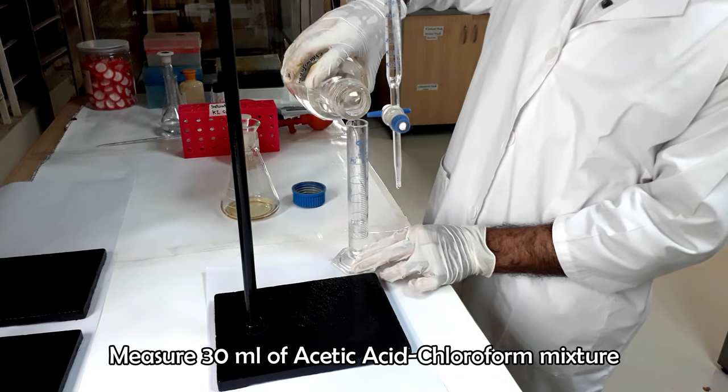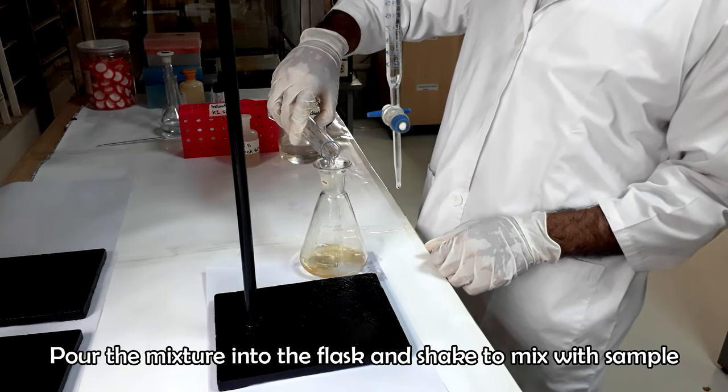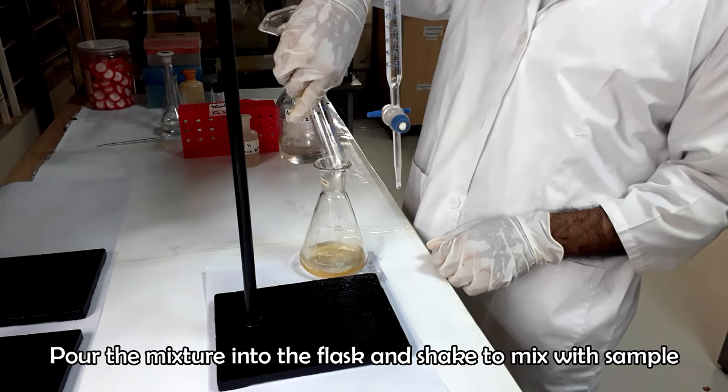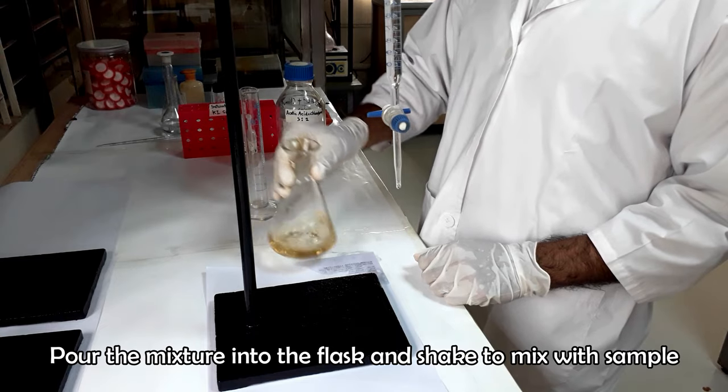Measure 30 ml acetic acid chloroform mixture and pour into the Erlenmeyer flask containing the oil sample. Shake and rotate the flask to mix the sample with the chemical mixture.